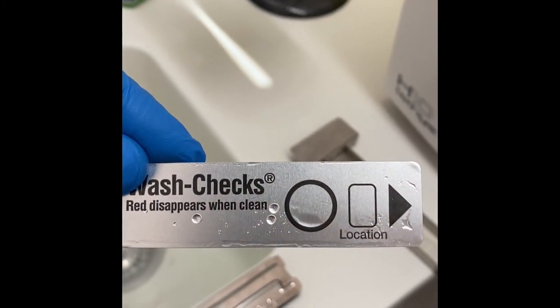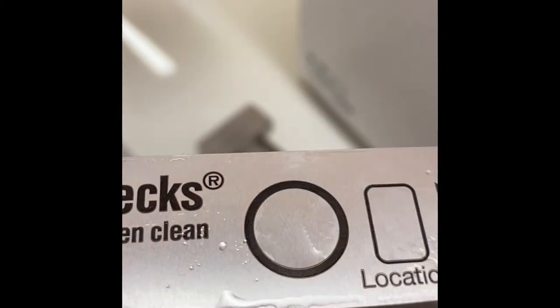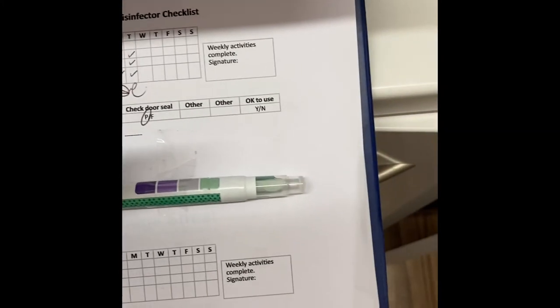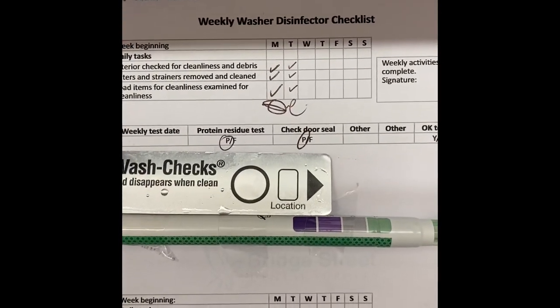The red should have now disappeared. This is the pass. If any red is still present, that will be a fail. This test needs to be sellotaped onto the weekly wash disinfector checklist.